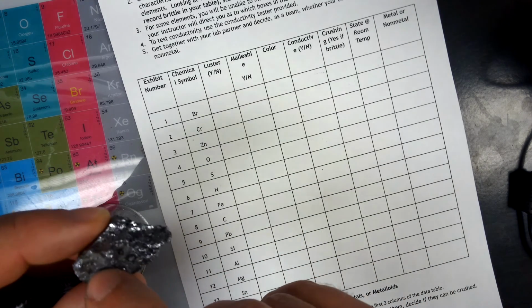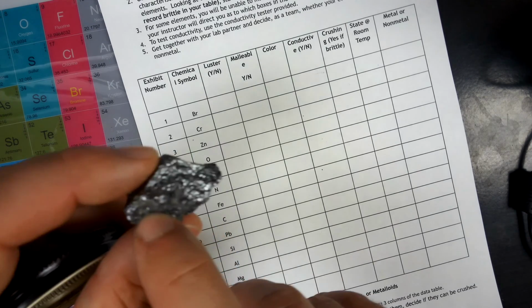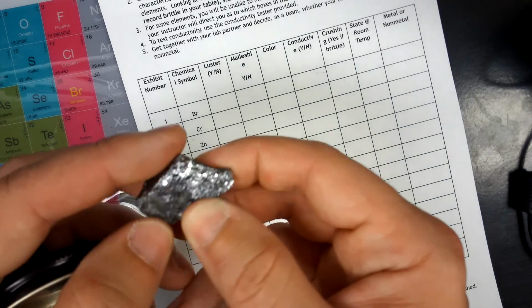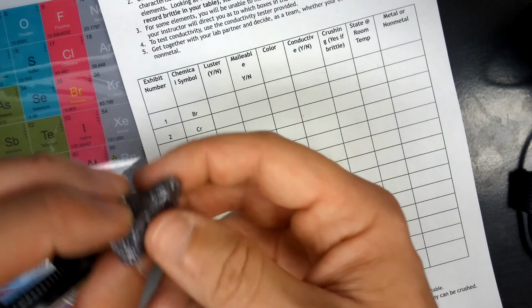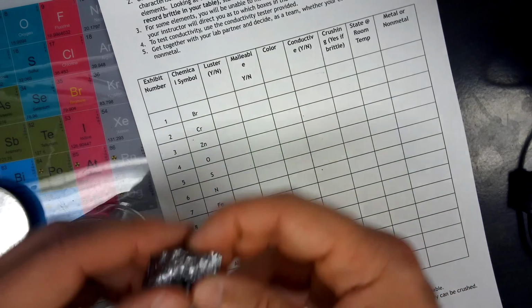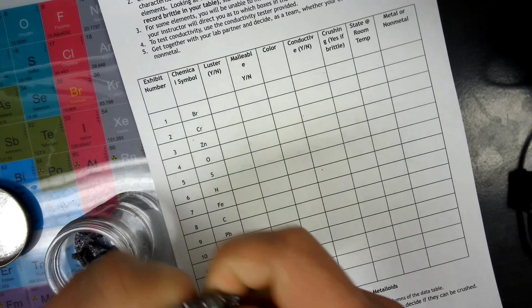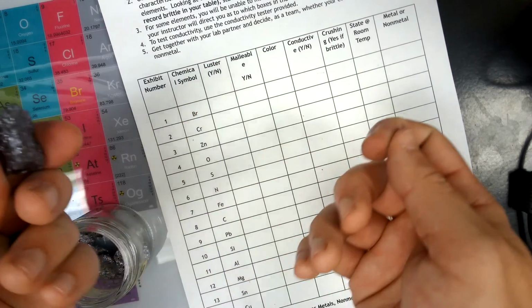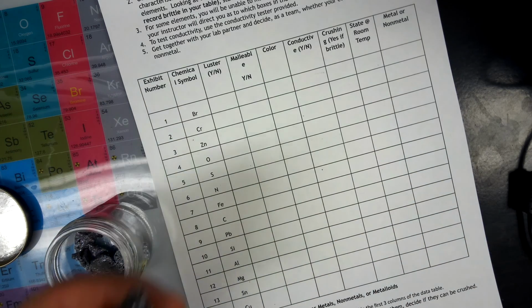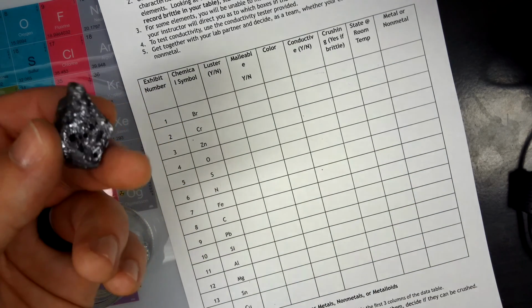That could be rust. It could be any sort of thing. You're pretending you're Mendeleev right now. Think about why it could sometimes be rusty, sometimes be shiny, and sometimes not. And then malleable. This piece is not very malleable. Once again, it could be the size of the piece, but this piece is not. Color is silver. You'll find that a lot of our elements are silver.